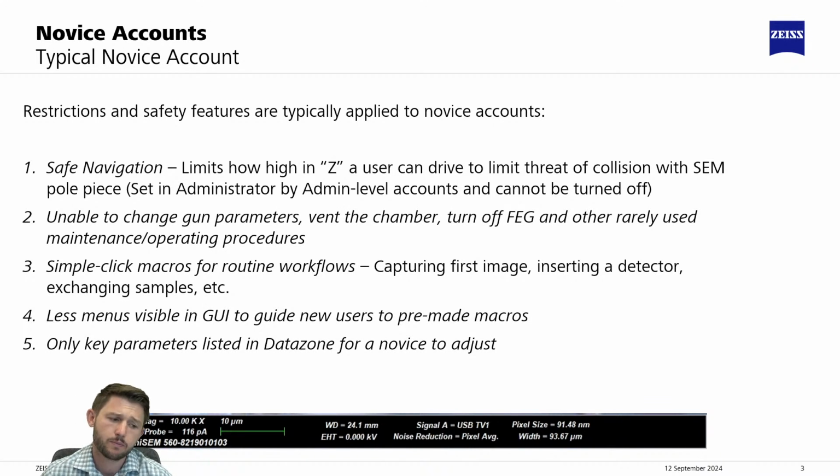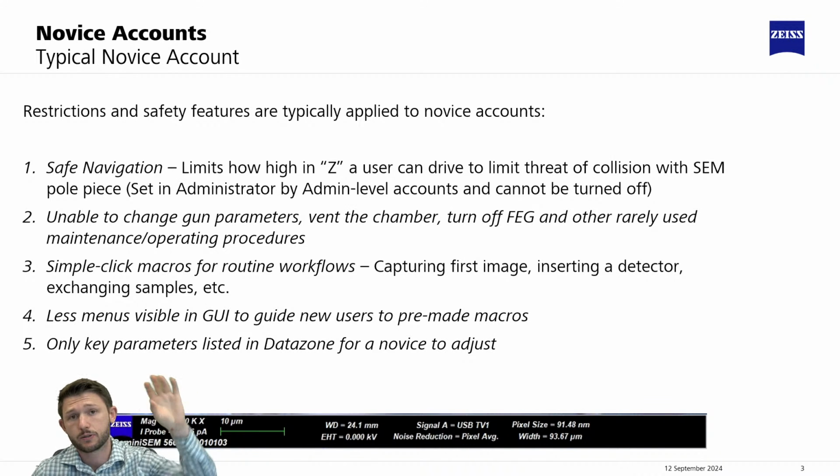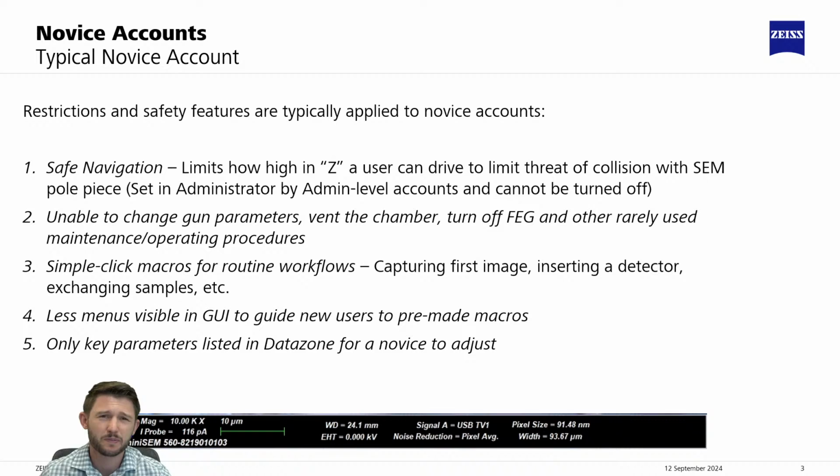Some of the other points: the menus can be hidden from the GUI. As mentioned, those buttons that are tied to the common workflows would be placed towards the top of the view, and some of the other peripheral menus that an expert user might want to toggle often would be secluded away so that it would simplify the workspace for those new users.